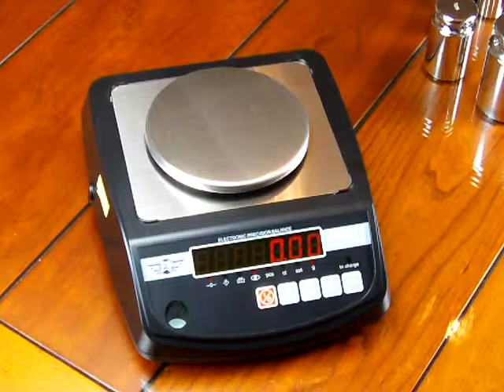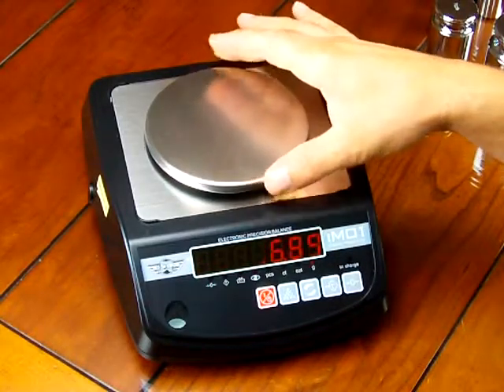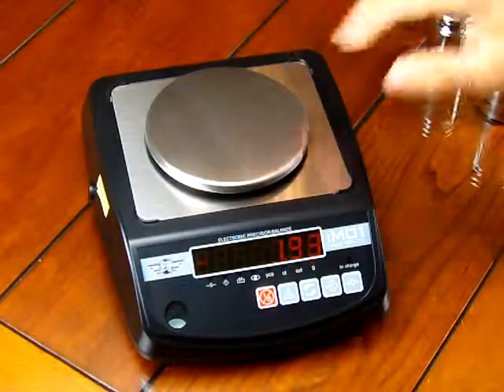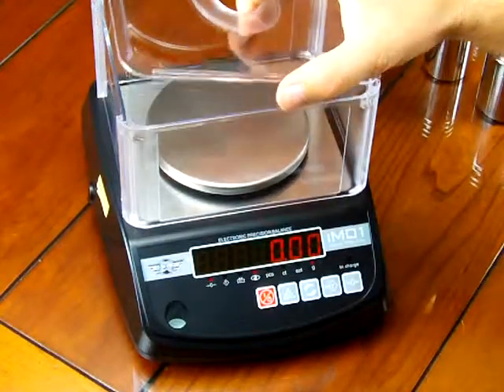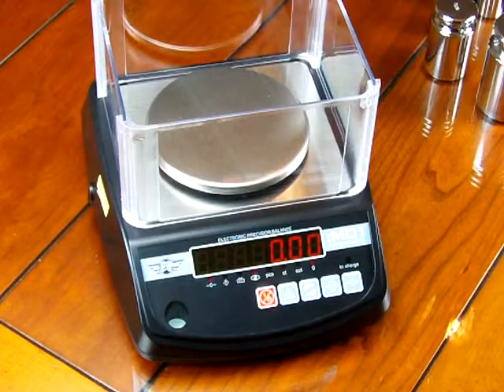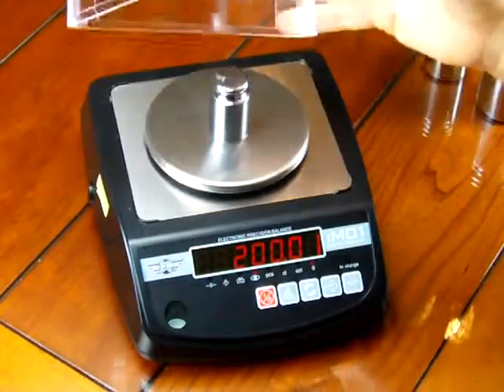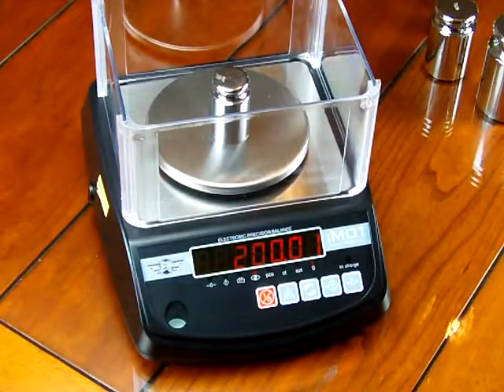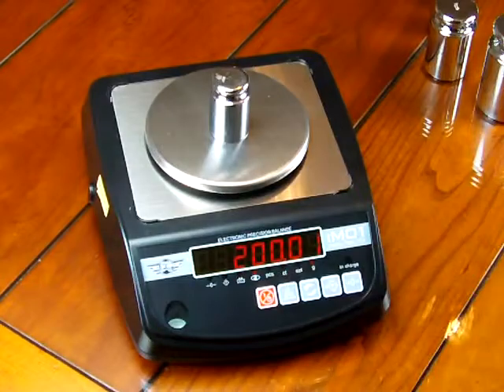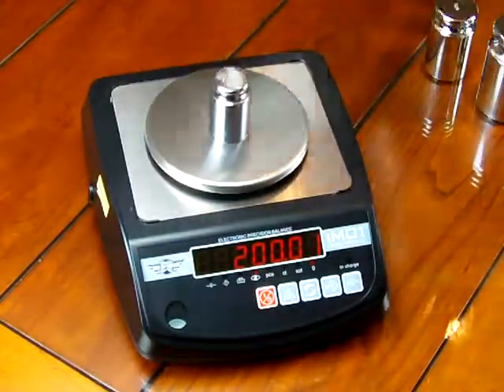Let's go over a few other features. The scale has a nice stainless steel platform — this platform is not removable, it's fixed, so for cleaning you would clean it with the platform right on it. The scale comes with a nice plastic draft shield. It's plastic, but consider the price you're paying. You just slide each of the panels in. This is a real nice feature because you're dealing with a scale that goes to 0.01 gram — there could be breezes and drafts underneath the platform, and this draft shield eliminates that issue. You can use it with or without the draft shield.